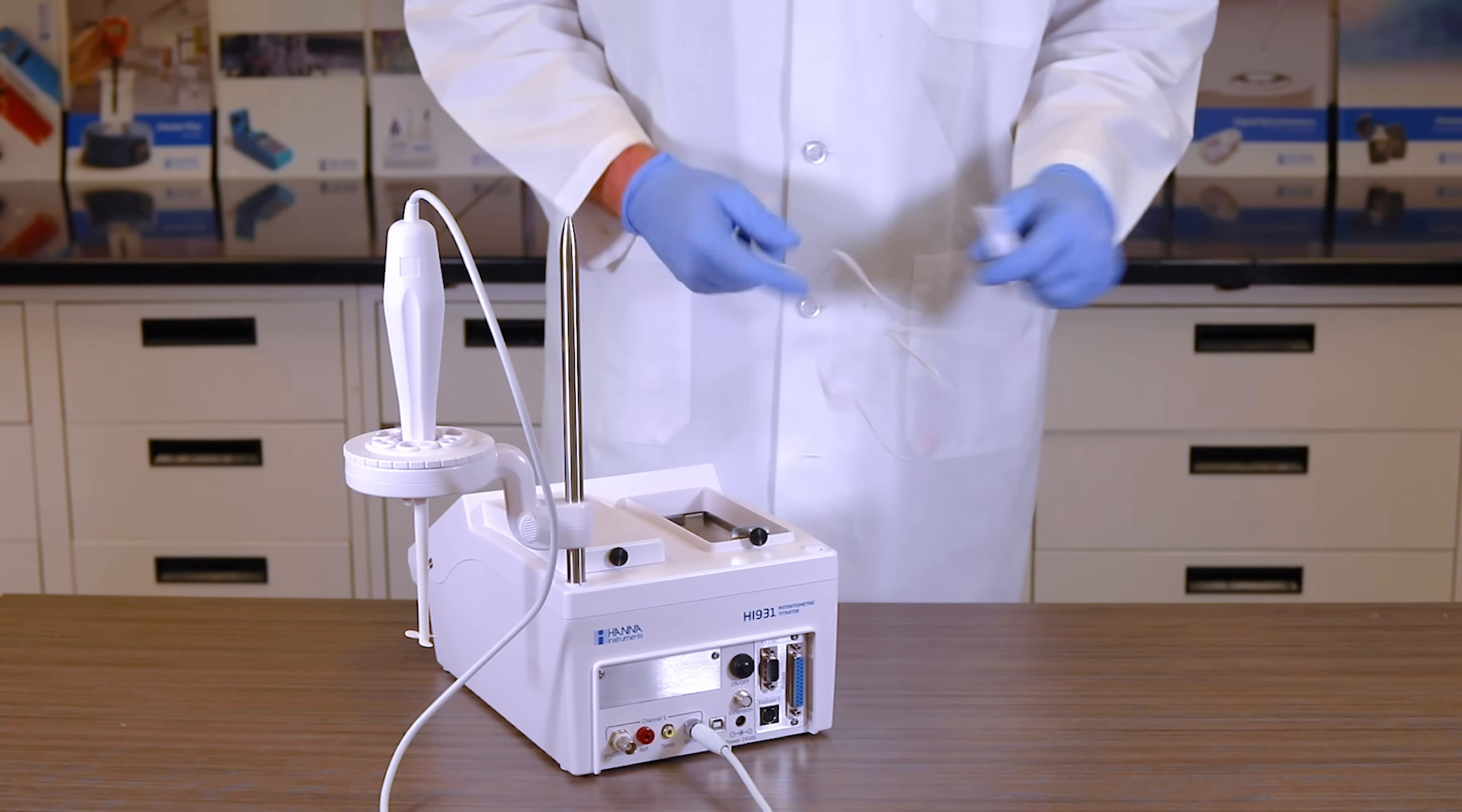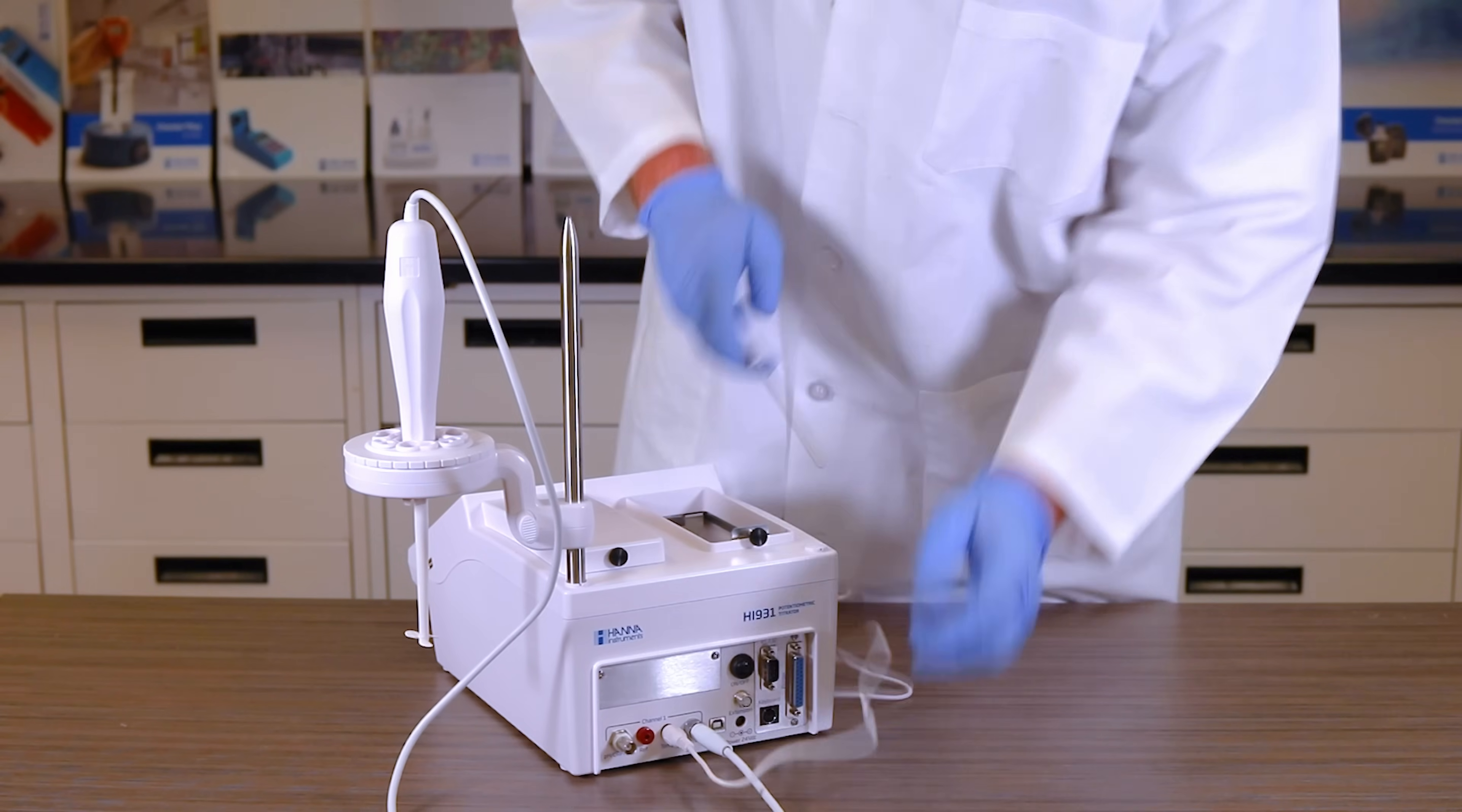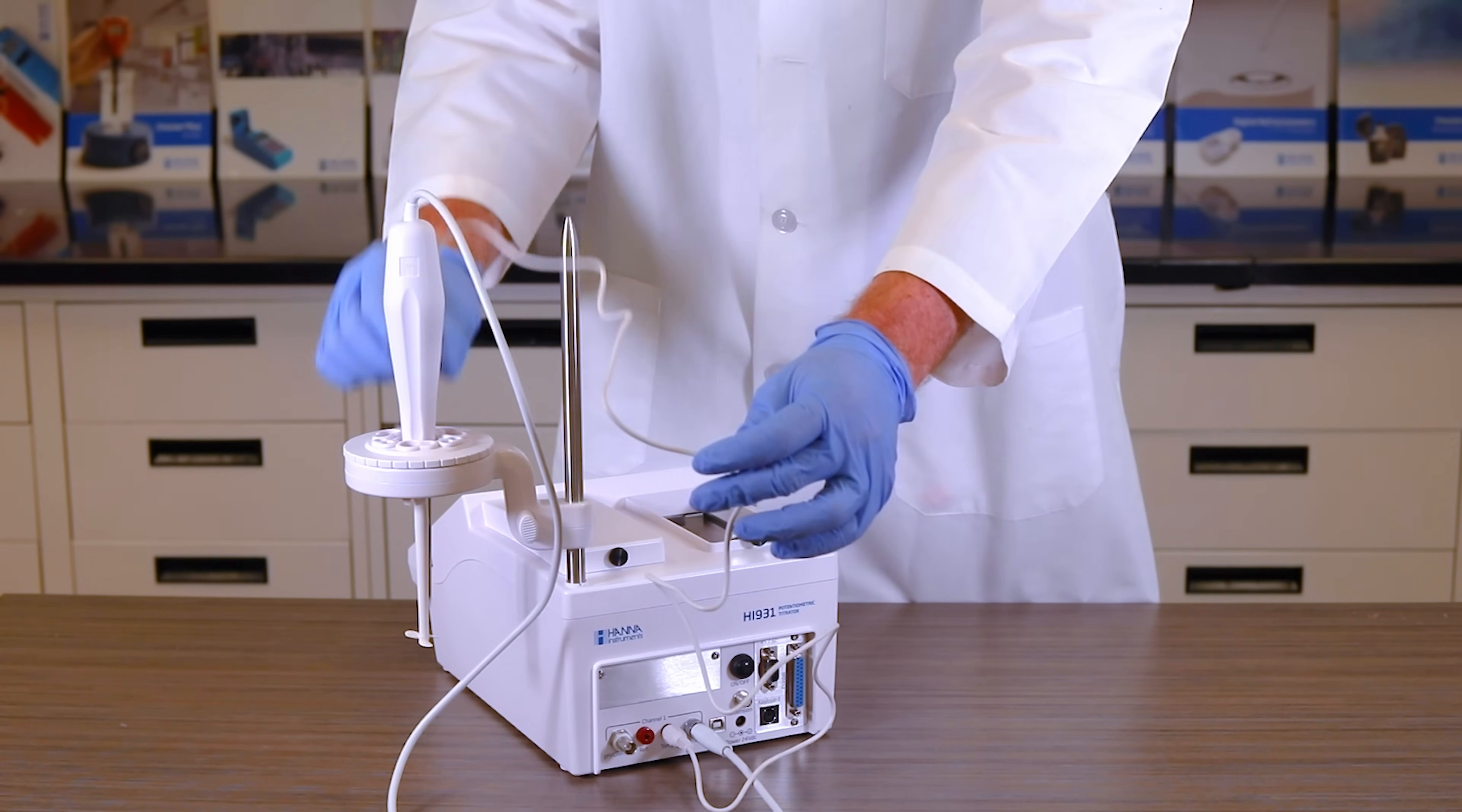Find your temperature probe and plug it into the back of your titrator. Place it into the temperature slot of the plastic assembly holder.